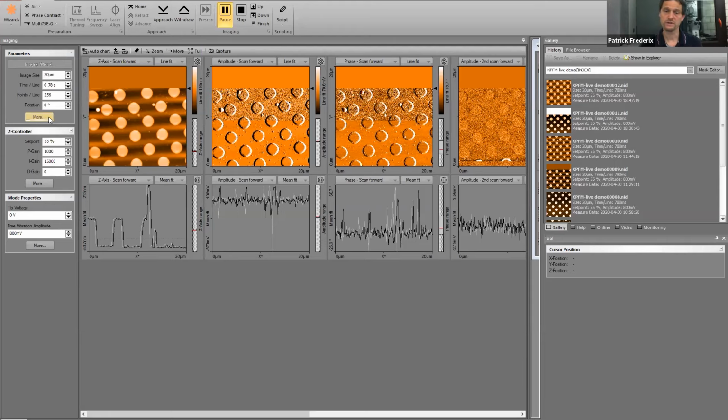You have to do this in a dual scan mode, and if your sample is not very flat, you really need contour following for that. It's a very qualitative measurement, and you often need to apply quite some DC offset potential to the tip to get sufficient contrast between the different materials. On our website, you see an example where I use this technique on this very sample that we now measured with KPFM.